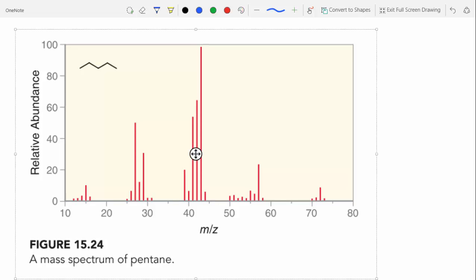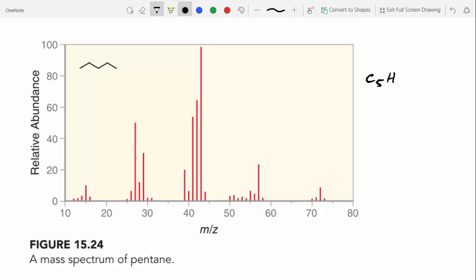So what molecule is this? Please tell me you guys can name this. N-pentane specifically. All right, so if we look at n-pentane, what should the molecular weight of n-pentane be? We can do the math, right? We've got C5, and 12 hydrogens, H12. So that's 5 times 12 is 70, plus 12. Wait, am I doing this wrong? 60. This is why I don't teach math. 72, right? So we'd anticipate the molecular weight of pentane should be 72.